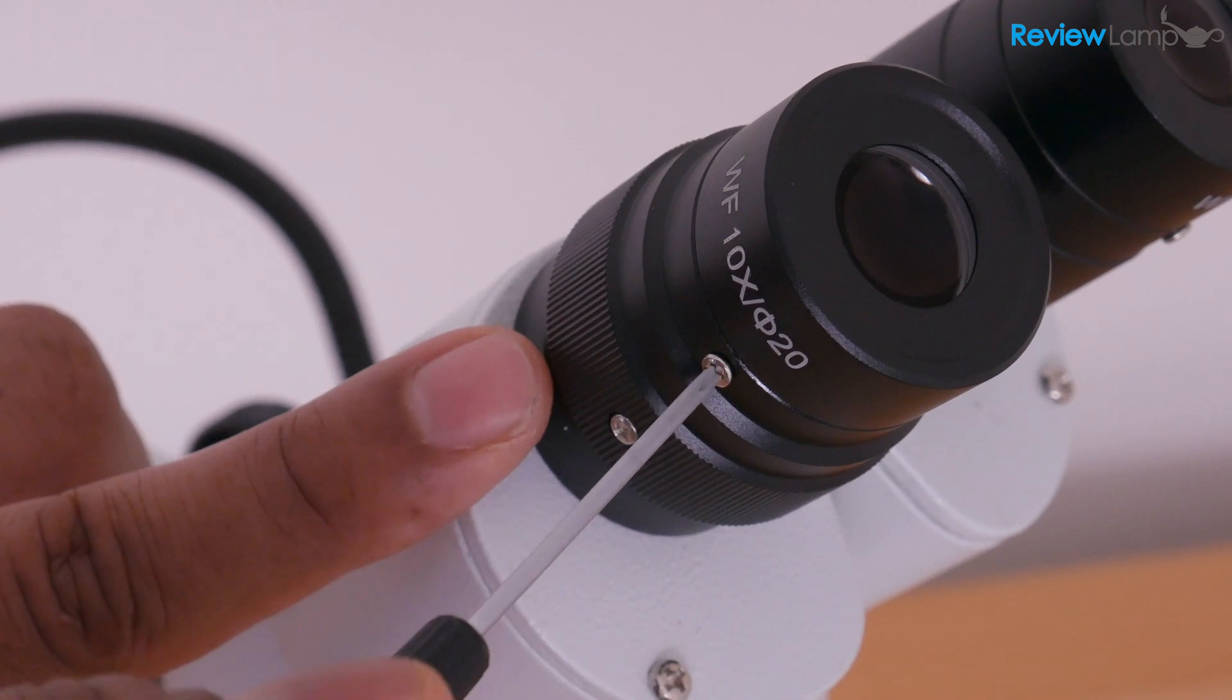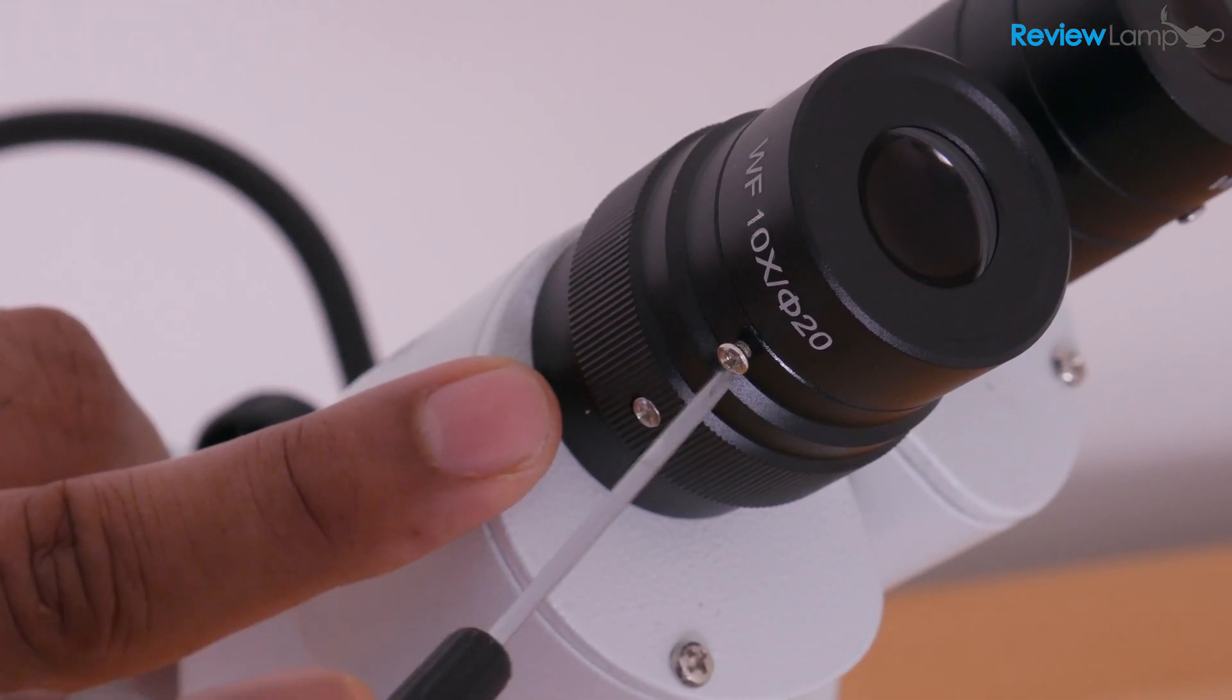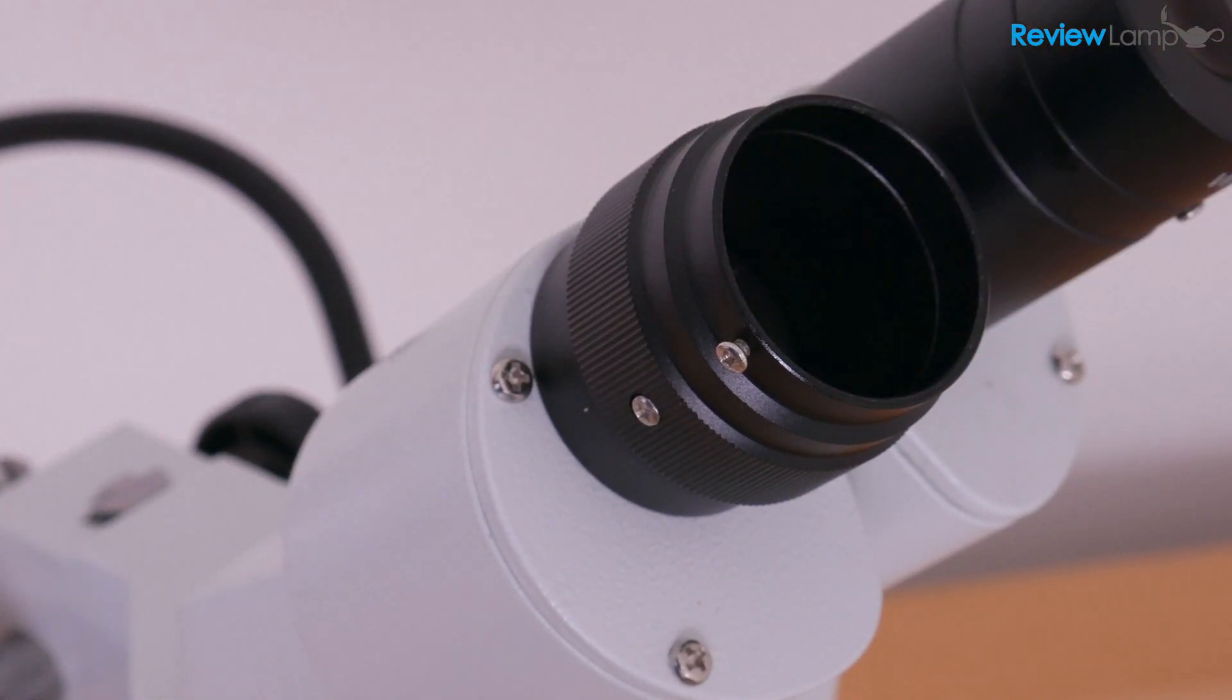So what we're going to do is we're going to unscrew that screw gently. You don't have to remove the whole screw, just a couple of turns. And then the eyepiece will loosen up and will pull out.